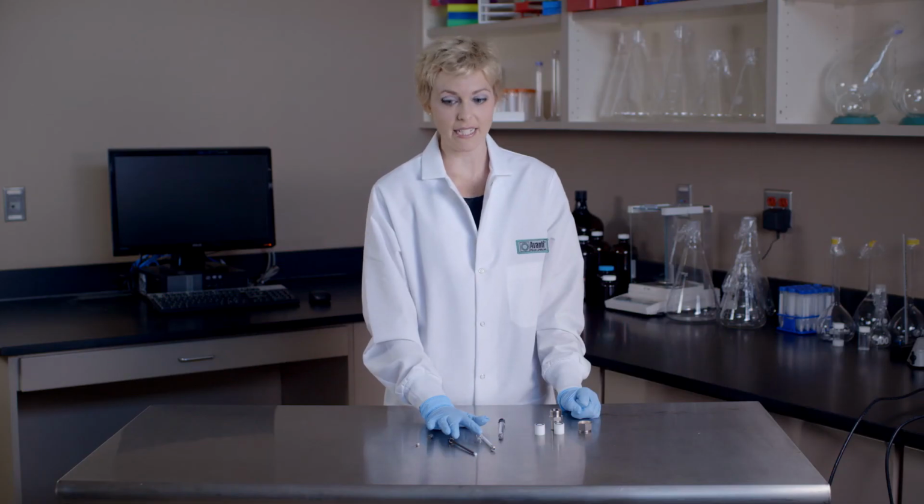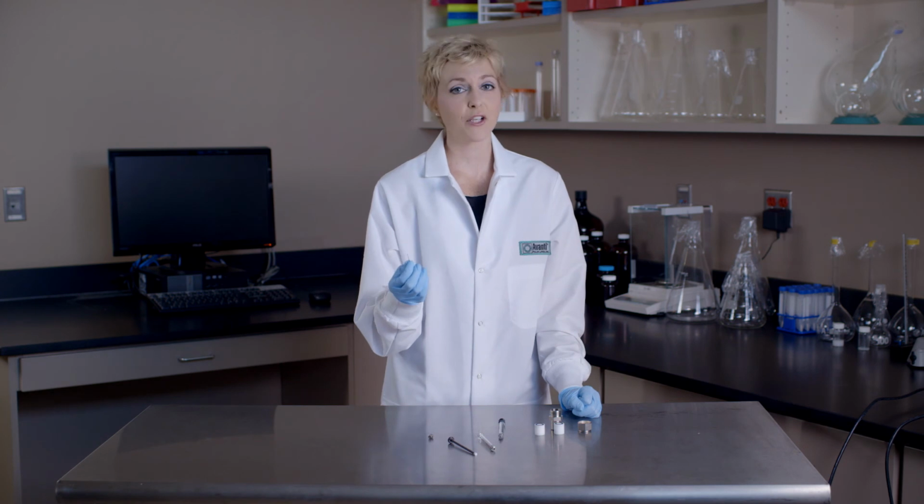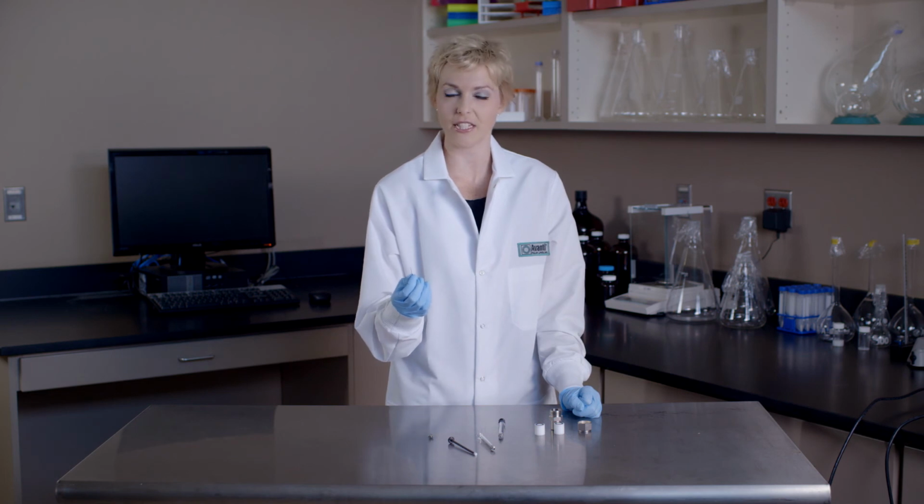Now for some important tips. If you must use a sonic cleaner to clean your syringes, only the needle may be cleaned with a sonic cleaner. After cleaning in a sonic cleaner, be sure to rinse with copious amounts of DI water and allow to dry completely prior to reuse.